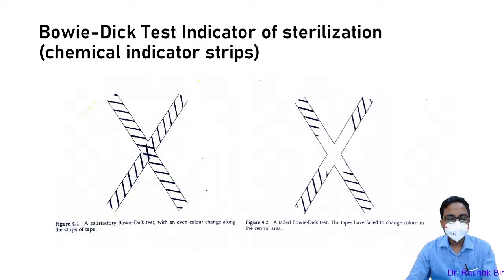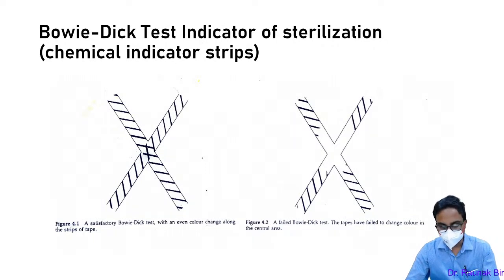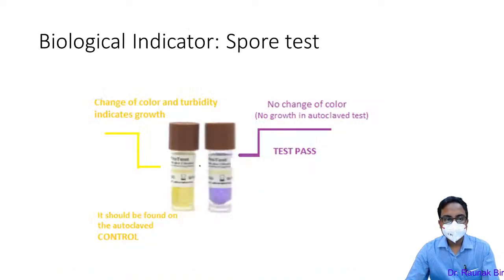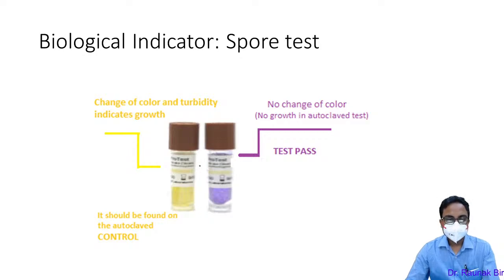With Bowie-Dick tape strips, if all the markings have appeared, that means the temperature has reached the required level — a satisfactory test. If markings are missing, the method has failed. The Brownie's tube indicator shows various colorizations according to which we assess whether the sterilization process is satisfactory. These chemical and heat indicators tell us about the conditions, not whether autoclaving was actually effective. The biological spore test is the indicator for the whole process.